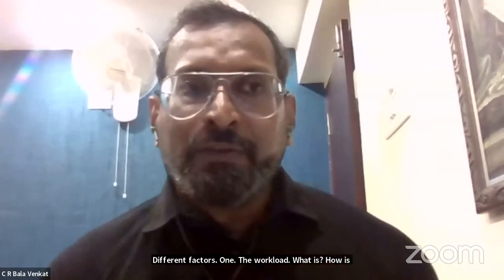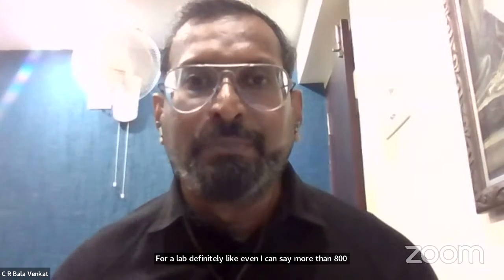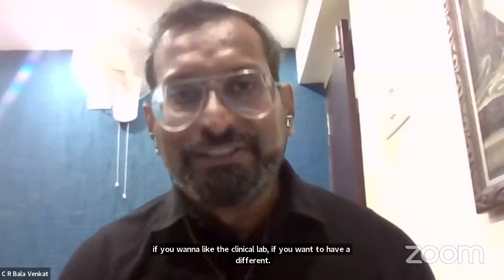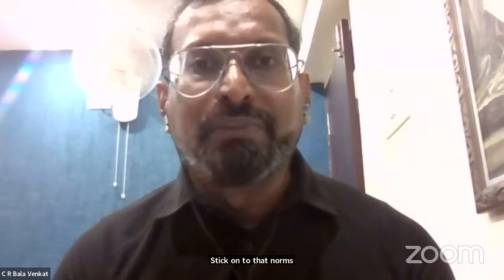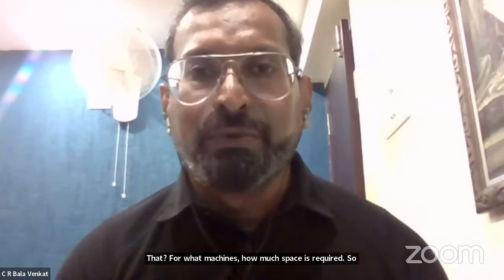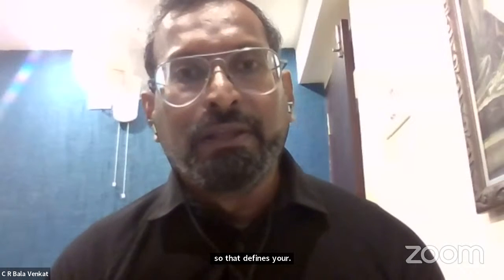For a lab, definitely, even I can say more than 800 square feet is good enough, or more, it will be better if you have it, for the laboratory alone. If it is like a clinical lab and you want to have different departments, maybe you have to stick to the norms of what machines need how much space. So what is your workload? What are the parameters you are going to run? That defines the volume of equipment which you're going to keep inside the lab.